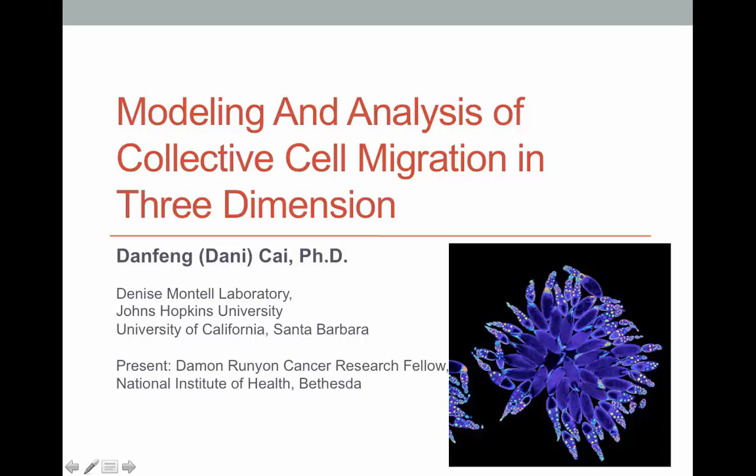Today, I want to focus not on the details of modeling, but instead on the revelations we've got by combining the live 3D imaging of this beautiful Drosophila ovary, as you can see here, with mathematical modeling. I hope my talk will be helpful not only to people interested in cell migration as a general topic, but also to the general public who are interested in knowing more about disease processes such as cancer cell biology. During this process, I will also touch on how Imaris will help us cell biologists visualize this process of 3D cell migration and also draw quantitative information out of our data, which is important if we want to publish a really nice paper.